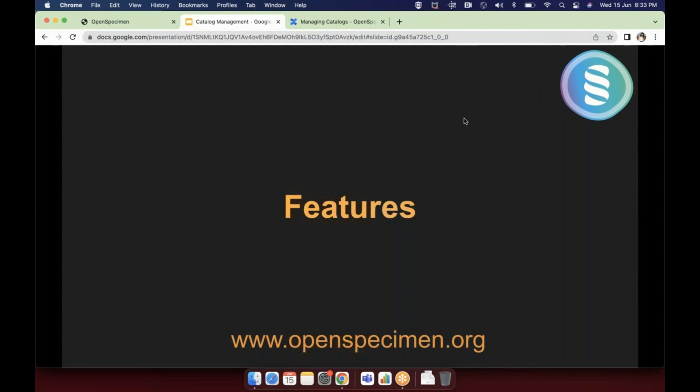All these can be managed within OpenSpecimen, where first of all, you can share your data, and someone who has access or catalog privileges can process the request as such. Now we'll look at the features of the catalog.